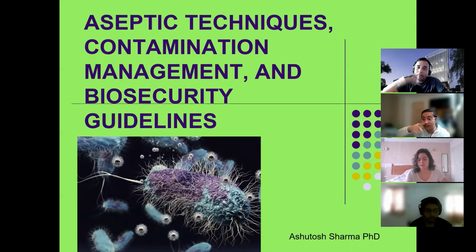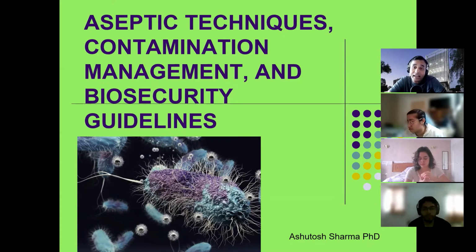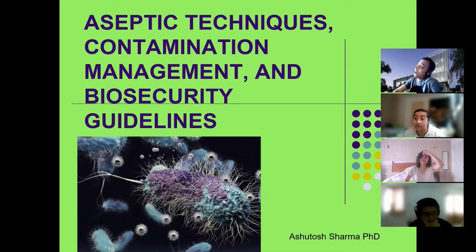UV light: you haven't switched on the UV light, or you have switched on the UV light and are working in it. That has happened with some of my friends, because they switched on the UV light and started working in it for 2 hours, and suddenly someone came and said, hey, you are working in the UV light, and he said, oh my God, now I will become a mutant, right? So these kinds of accidents are also common.